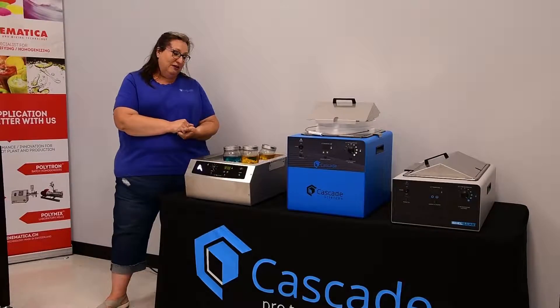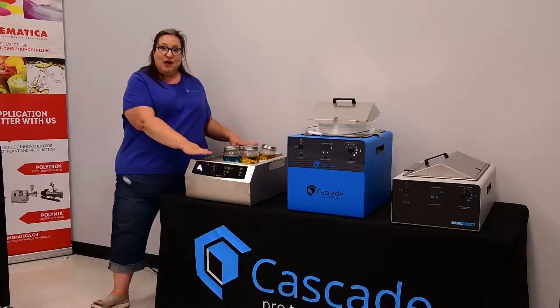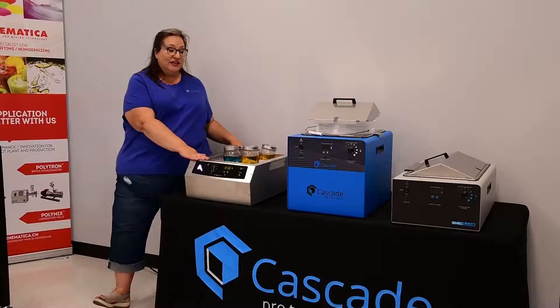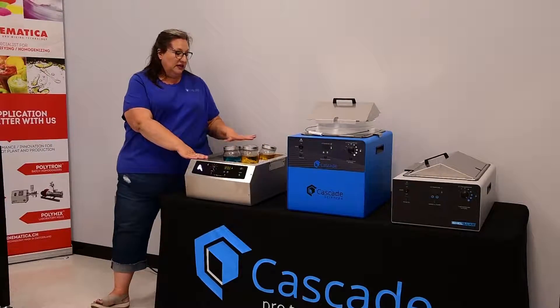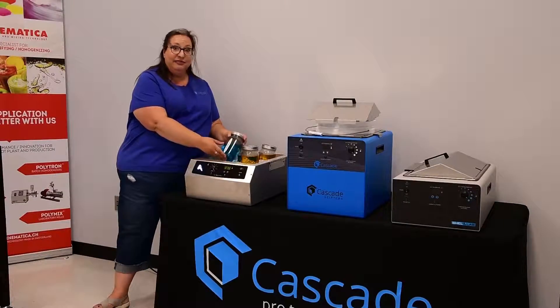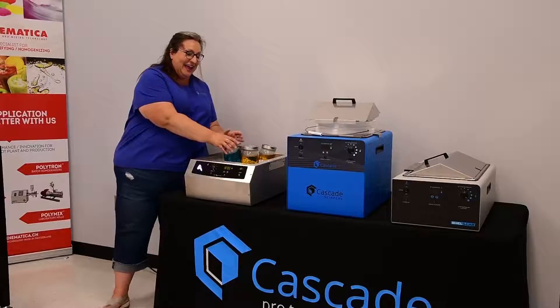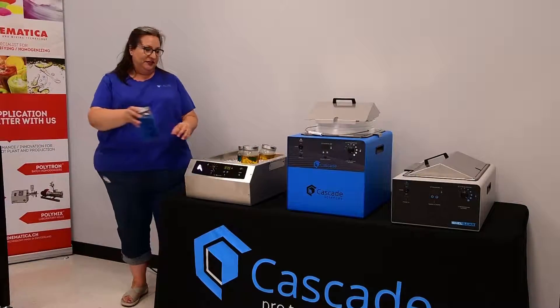The downside of a water bath is that it's the number one source of contamination in the lab. If you think about it, you have a bath that's wet and at room temperature — that's a swamp, and these are all full of illness and despair. So you've got all of this stuff in the bath, incubating in the bath, and then you're going to pick it up and carry it and drip that mess all around the lab while you go.